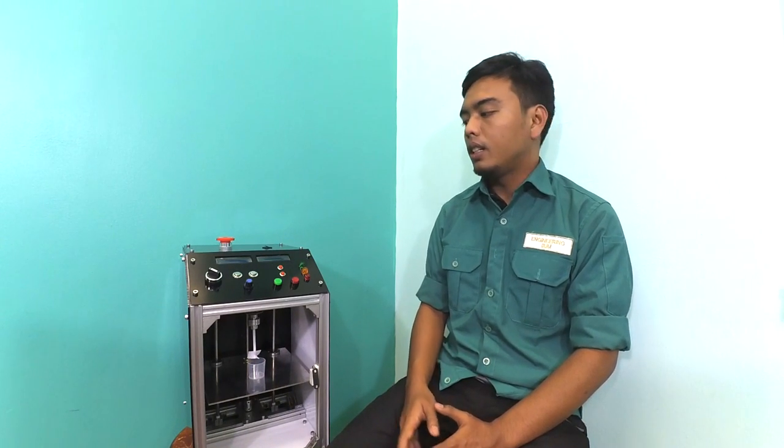Introducing the stirrer machine. This machine is able to mix a small scale volume of mixture as low as 1 ml. This machine is also suitable to mix high viscosity solutions.